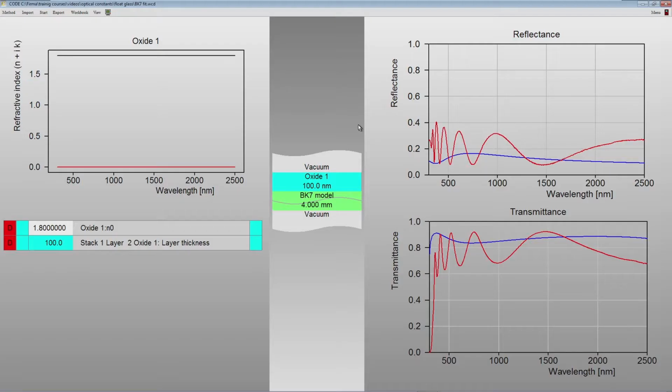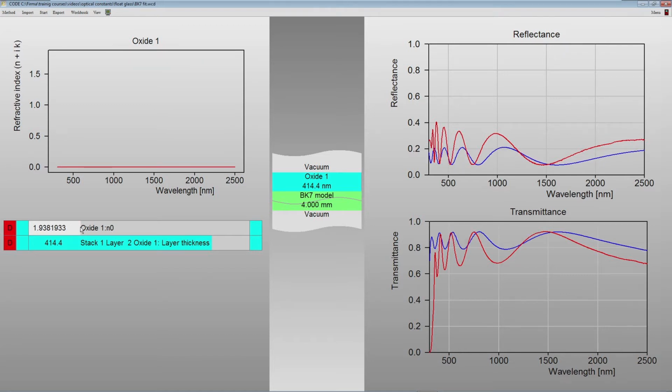Press F7 and verify that we now see different blue spectra, and the spectra depend on the thickness. I vary the thickness now, and maybe you remember a discussion of wave propagation in thin films. The maxima here, they will mainly depend on the N0 value, on the height of the refractive index.